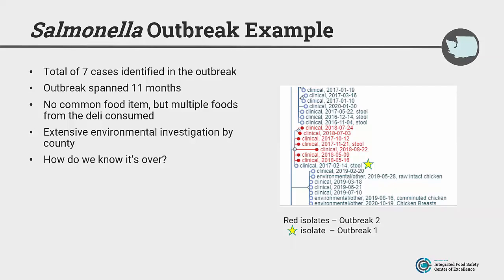So this picture here is a current SNP tree that I grabbed just last week from the NCBI pathogen detection portal, looking at our cluster, and you can see there's still 8 isolates on our little outbreak clade there. 7 of them are the isolates from this particular outbreak, and then that 1 isolate from the previous rotisserie chicken outbreak that jump-started us with our hypothesis generation. So based on this, we can have a good idea that we're not continuing to see transmission in this facility.